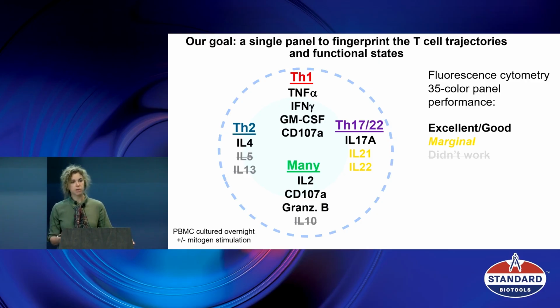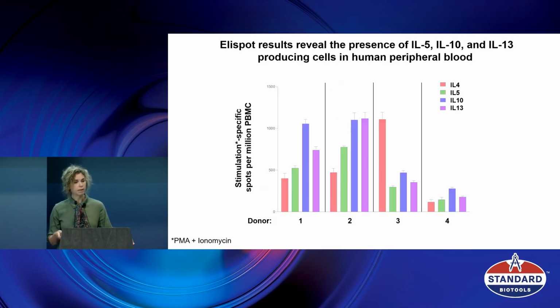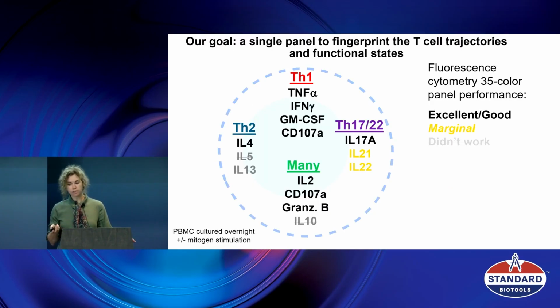And it's been about a year that we spent to figure it out. And unfortunately, although we knew that the cells are actually making the cytokines, so we measured cytokines from the same samples by ELISpot, for example, like an orthogonal technique, so we knew that we have cytokines made. We couldn't succeed in detecting certain cytokines. Some were marginal, and some were really beautiful.